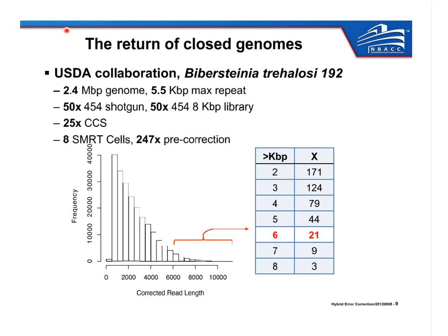In order to assemble these with something like Illumina or 454, you have to have a lot of large libraries to span over these repeats. So you need to have something like a 7K or 8K library in the 454 data, and you need to have other libraries complementary with that to figure out the actual structure within the repeat.